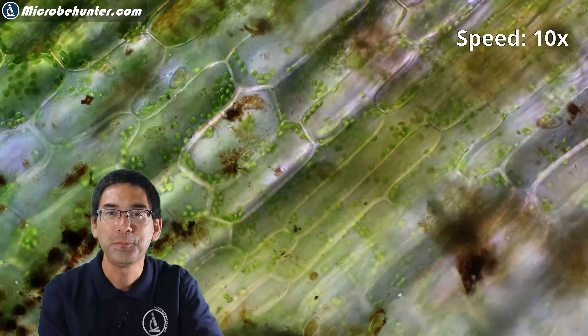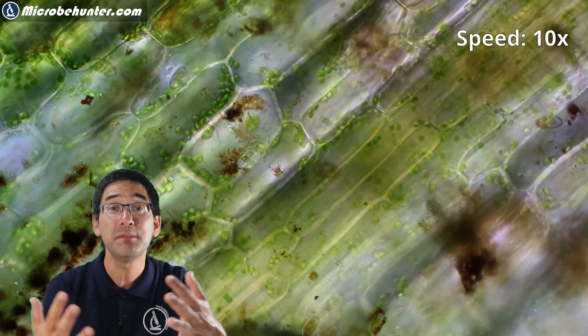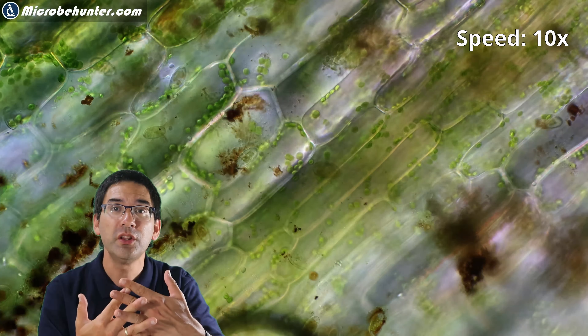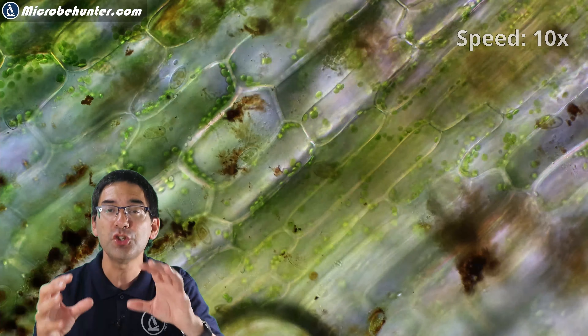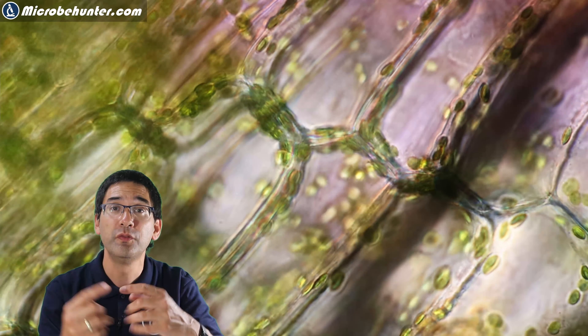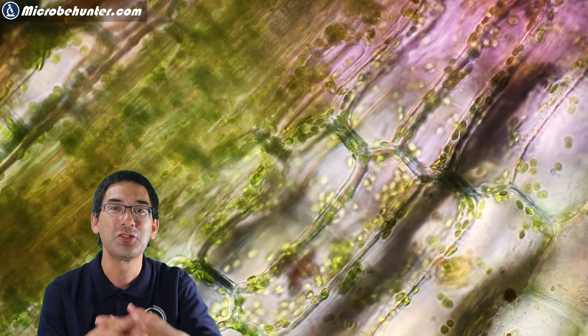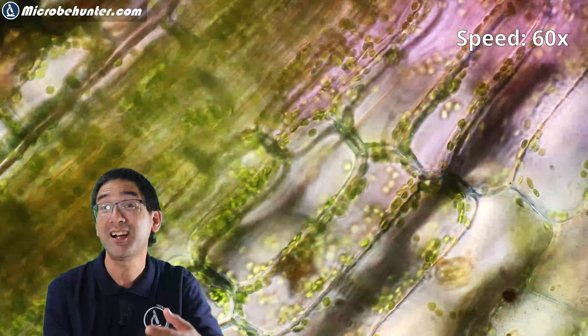Why are those plants doing that? This is actually a common thing that many cells do. The cytoplasm is moving around, and one reason that scientists think is that this way the position of the chloroplasts can be adjusted so that they can harvest the most light. I've also done a little bit of time-lapse, which illustrates quite well how the chloroplasts are moving inside the cell. I always consider this quite fascinating to see — it shows that life means movement.